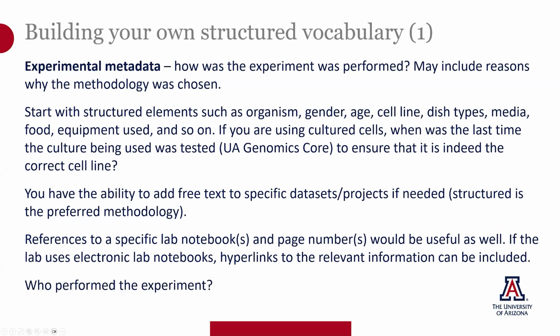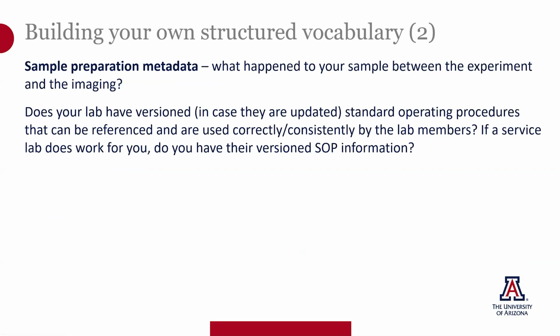And this is possibly important. Who did the experiment? Some labs have that person who maybe only lasted 6 months in their lab, and everything that they did didn't seem to work very well. Wouldn't it be good to know 3 years from now that certain data was processed and collected by that person? You might consider if you want to use that data, and if you trust it, that would be good information to know.